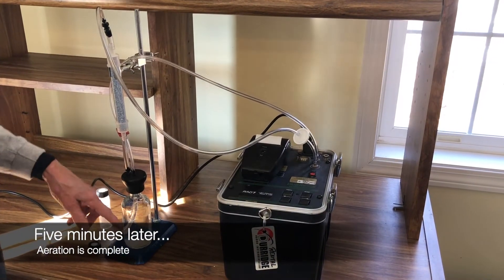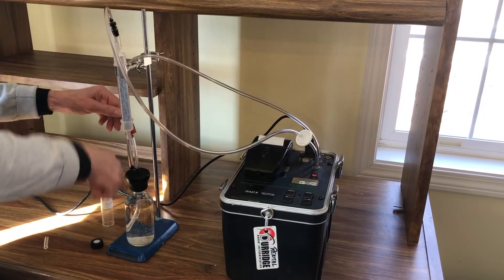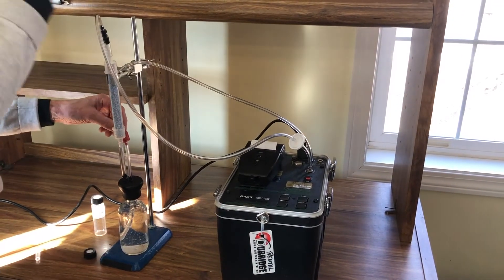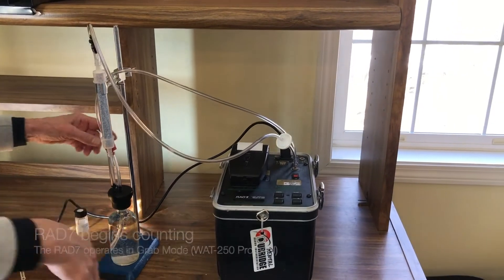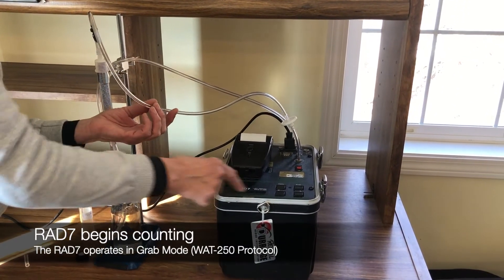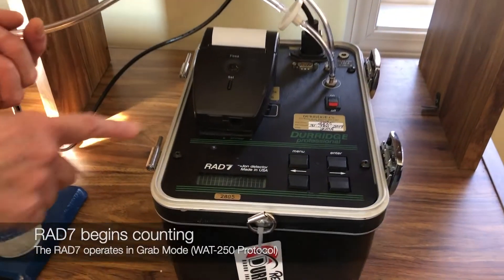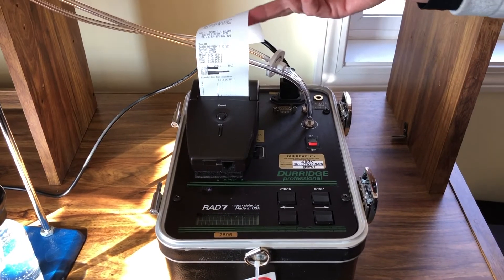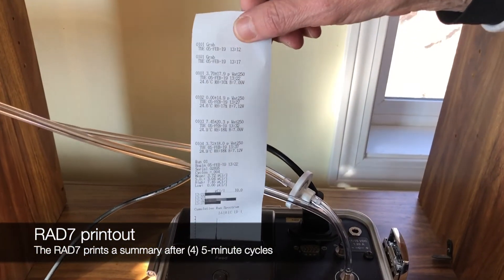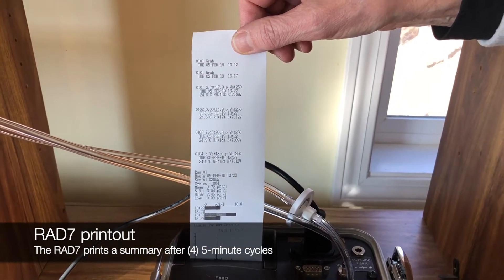Now the water has been aerated for five minutes. And because we're in a closed loop, we're going from the inlet to the outlet here. All the radon is in this loop, and now the rad7 will be counting. You can see the counts happening — it's in grab mode, watt 250. Now the rad7 has run four five-minute cycles with the air that was in the closed loop and printed out a summary.